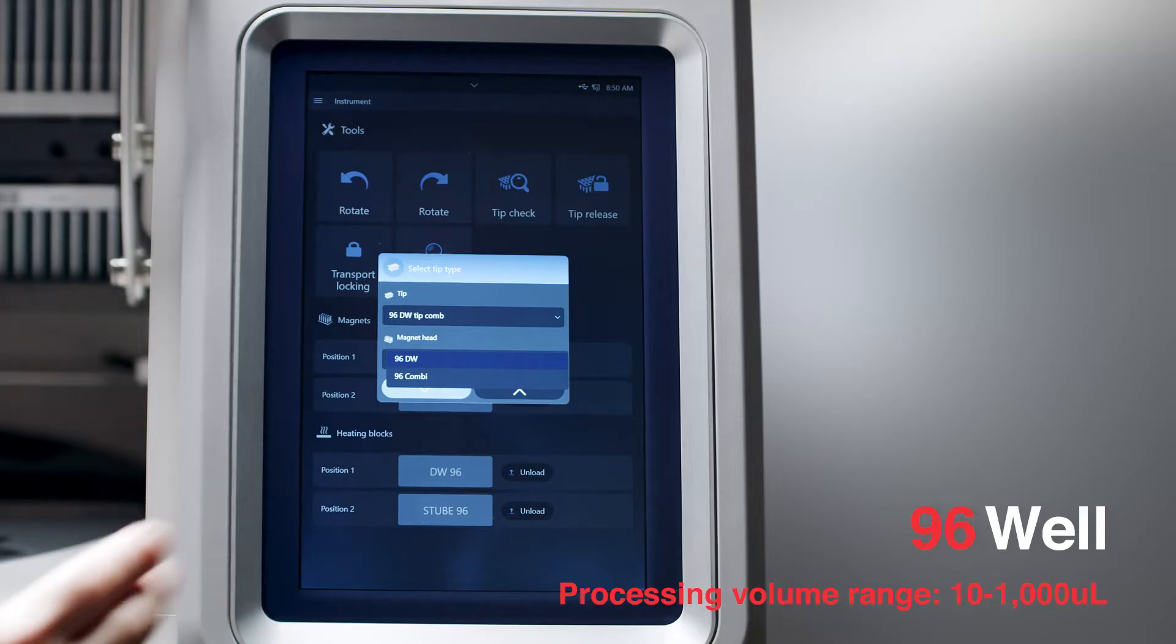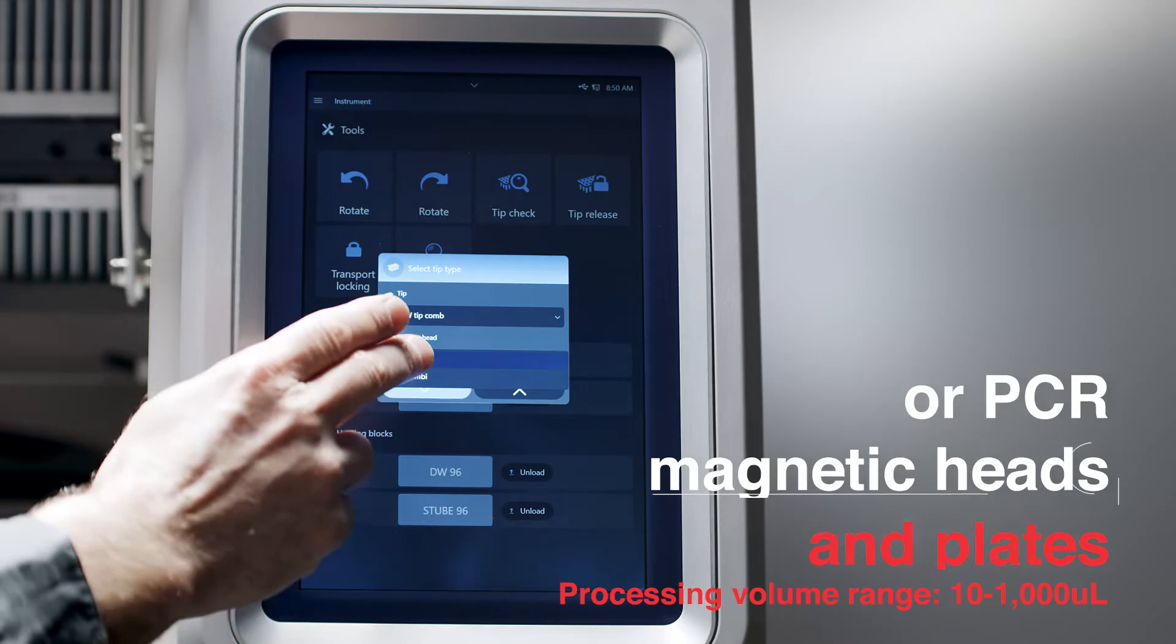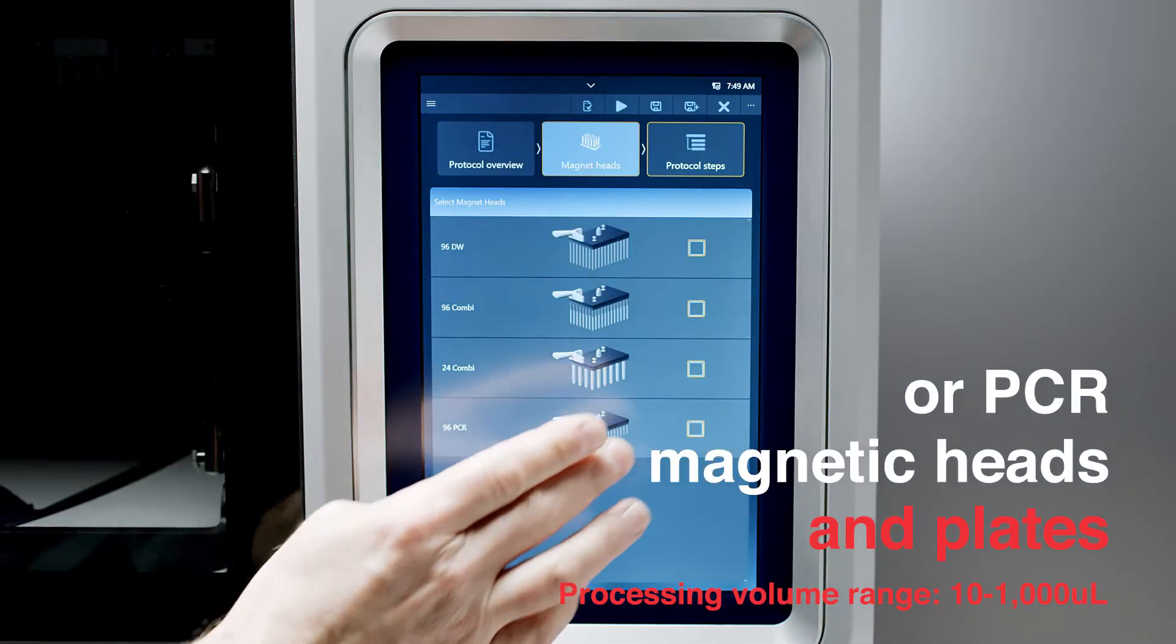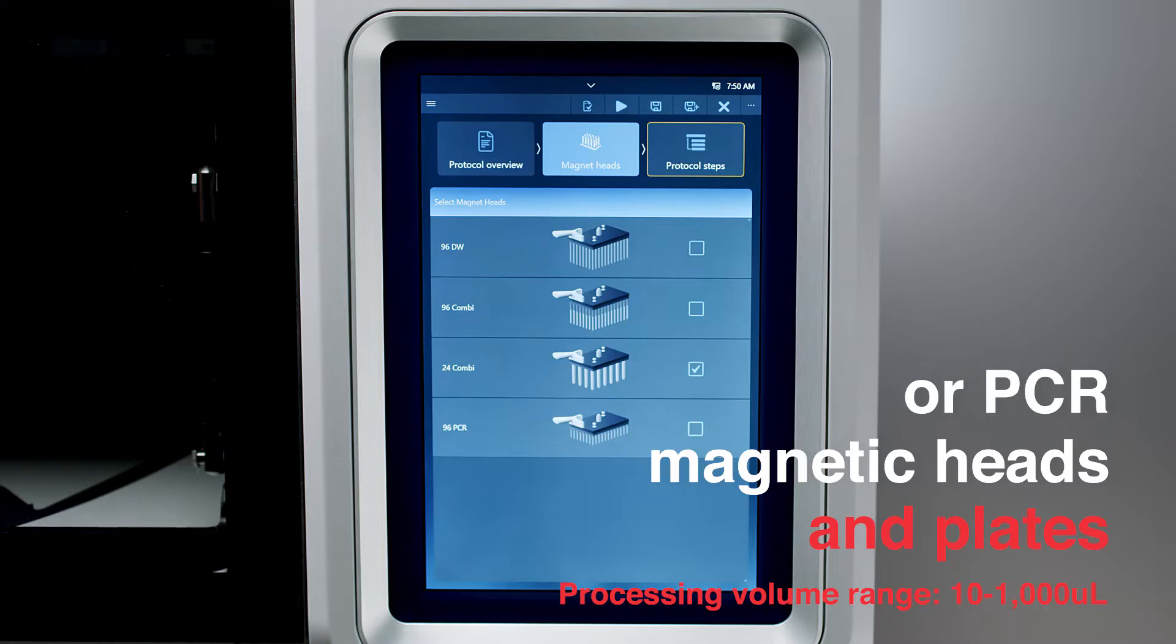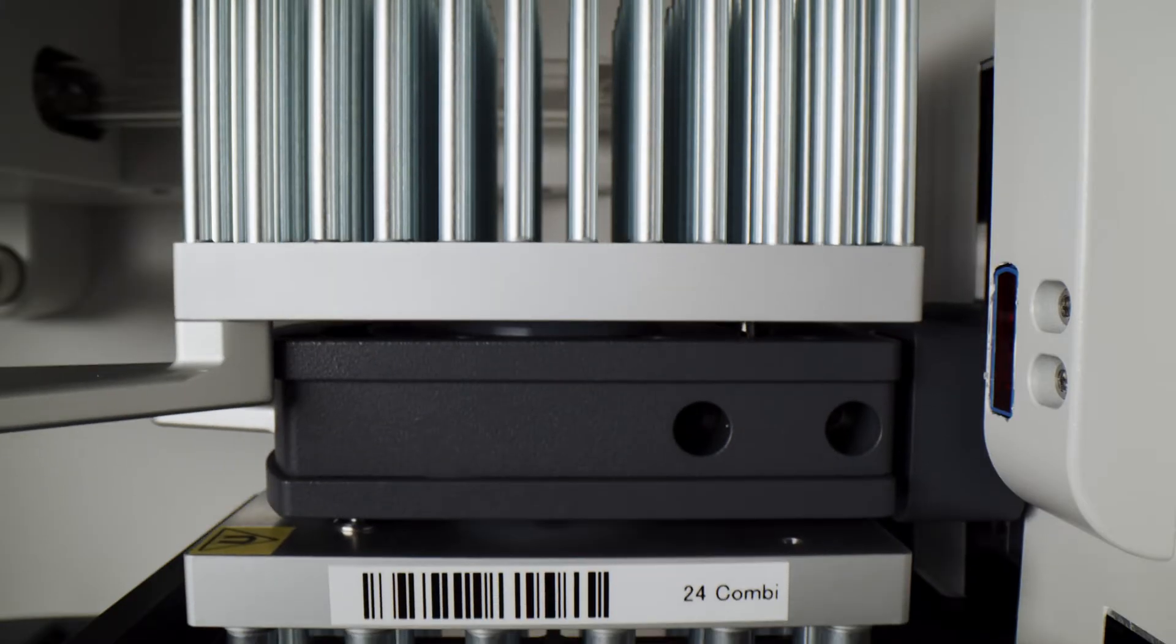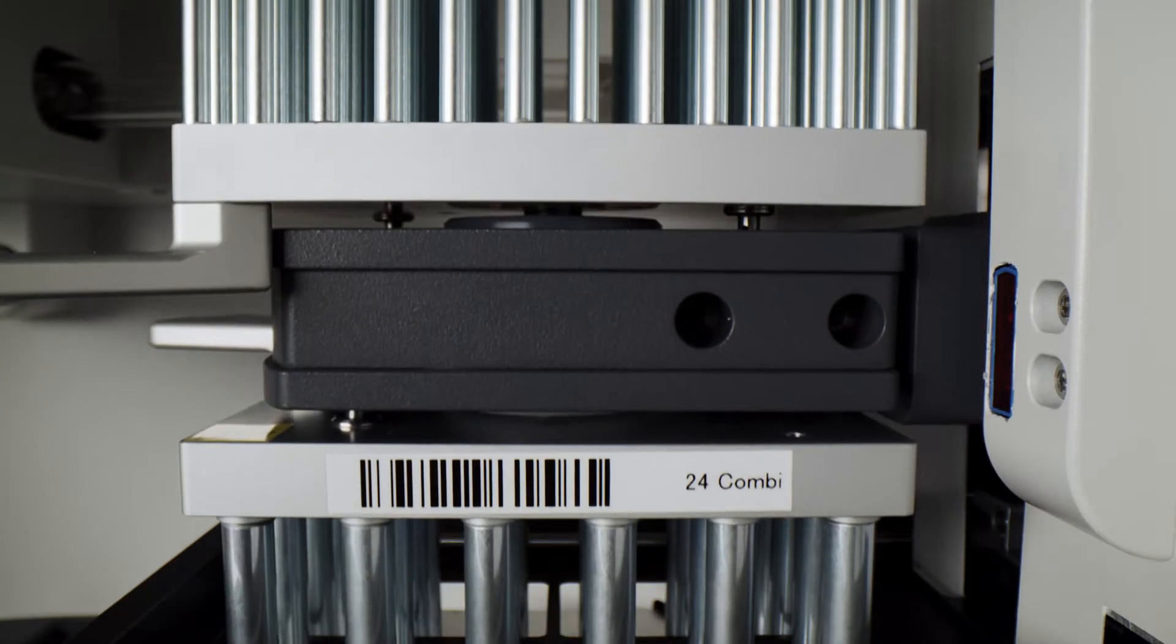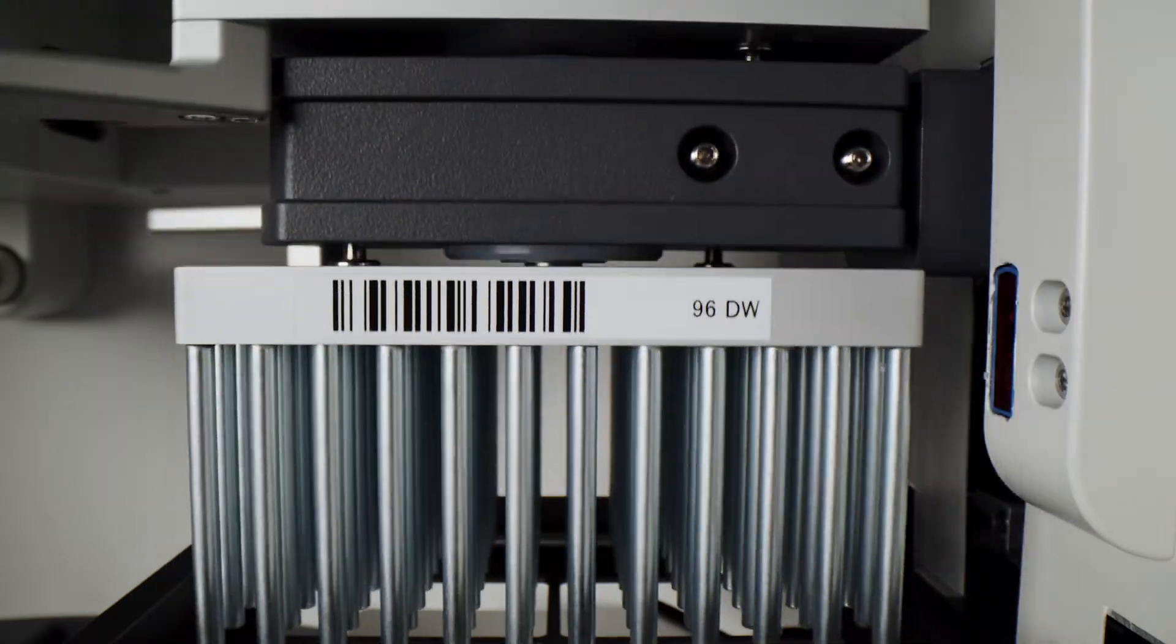Select from a range of corresponding magnetic heads and plates, so you can work in large to small volumes. Switch between two magnet heads in a single run.